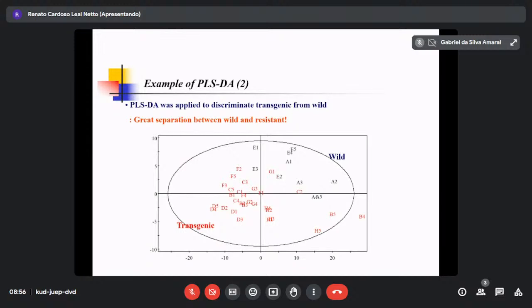This one is like when you do a t-test and ANOVA test at 95% confidence. For example, now this one is outside of 95%, which means, because a t-test or ANOVA test concerns only one variable, right, that this variable is located in the region of 5%, 2.5% and 2.5%. It's very exceptional. That's it. And the same for principal component analysis. In this model, this one, you can say, is very exceptional.